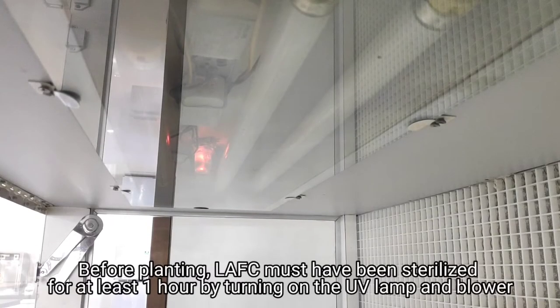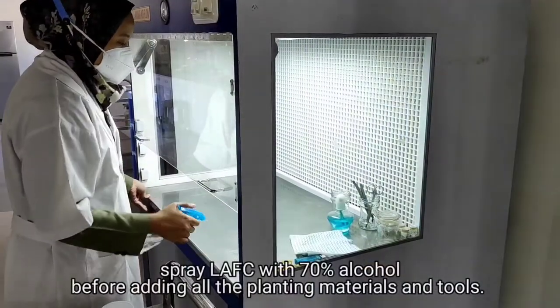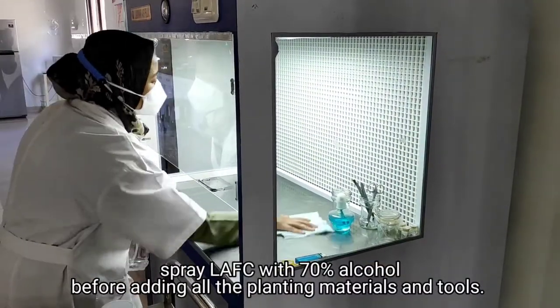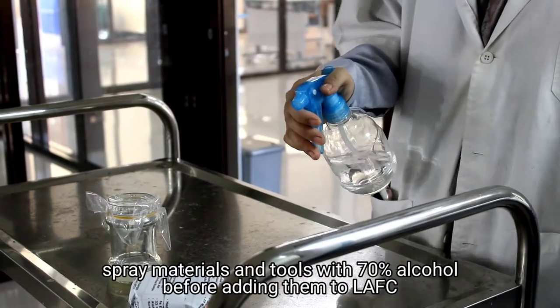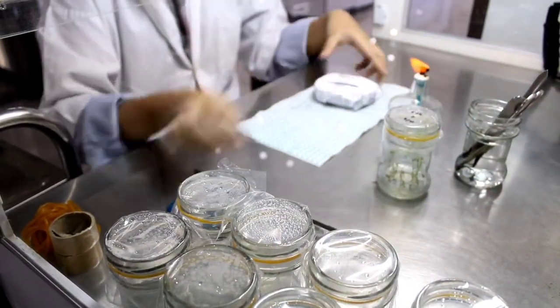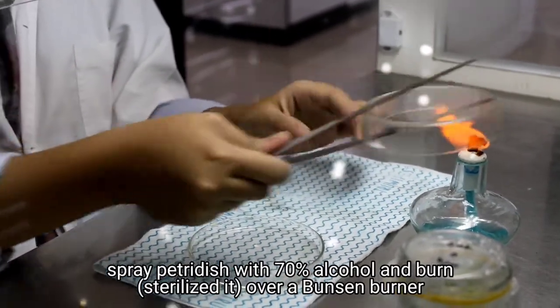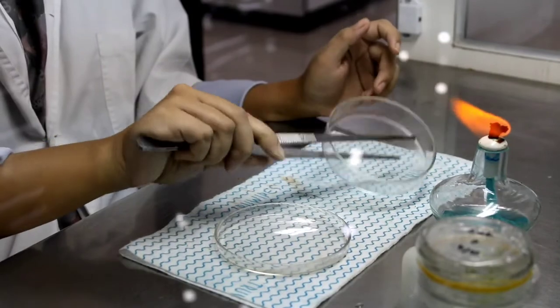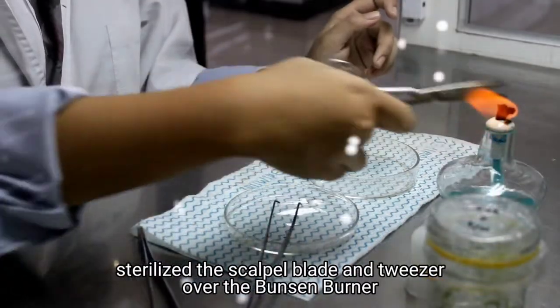Before planting for subculture, LAFC must have been sterilized for at least one hour by turning on the UV lamp and blower. Spray LAFC with 70% alcohol before adding all the planting materials and tools. Spray materials and tools with 70% alcohol before adding them to LAFC. Light the Bunsen burner. Spray the petri dish with 70% alcohol, burn and sterilize it over the Bunsen burner. Sterilize the scalpel blade and tweezer over the Bunsen burner.